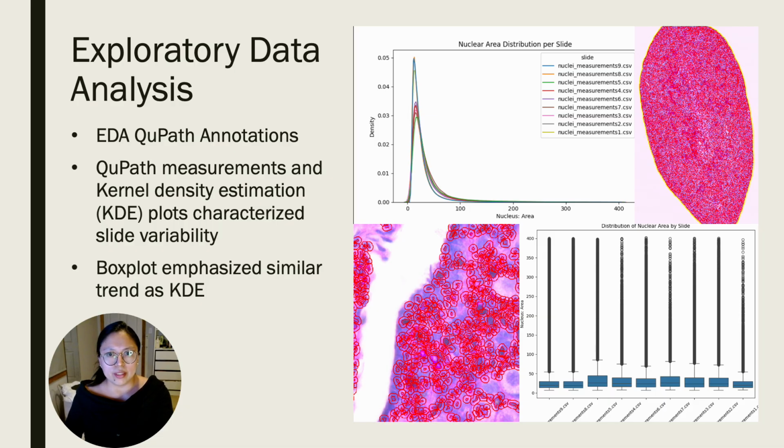There's some skewness present, meaning a slight imbalance in how the values are distributed, but overall the trends are very similar. We also confirmed these findings using a box plot, which showed comparable patterns across all samples.